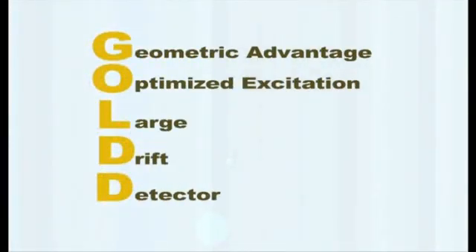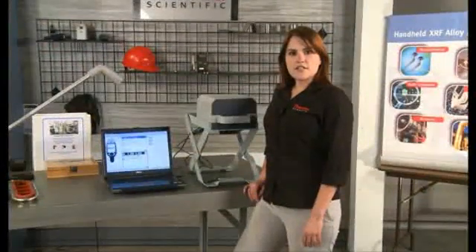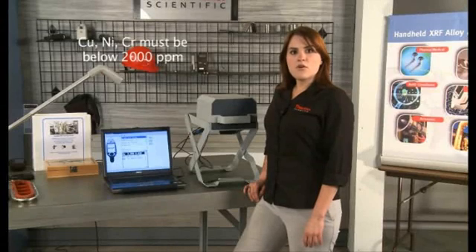Carbon steel piping and welds are utilized extensively in the HF hydrofluoric alkylation units that reside within petrochemical refineries. The Niton XL3T gold instrument can perform an in-situ analysis of 3 key residual elements found in carbon steels: copper, nickel, and chrome. It has been determined that a combined concentration of 2,000 ppm or greater of these 3 residual elements will reduce the HF acid corrosion resistance of the carbon steel.